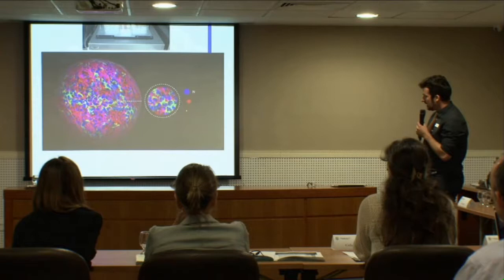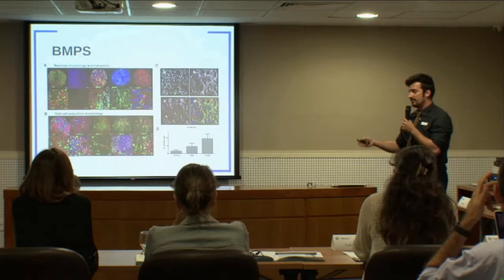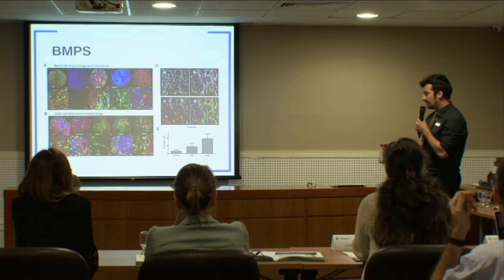So like I say, we did different stainings to see that we have different cholinergic and glutamatergic neurons and so on. As well, we try to quantify how many astrocytes, how many oligodendrocytes, how many neurons we have every time we do the same experiment. And that's really important because, like I say, for neurotoxicology, you have to have the same one all the time.